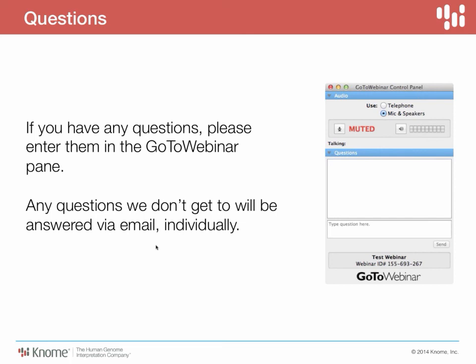Then the annotation is run, and it's a fairly rapid process. All of that filling in of genotypes, converting this into an internal format, and adding all of those annotations so that they can quickly be used later only takes about half an hour typically, even for a family. So you can get going quite quickly.